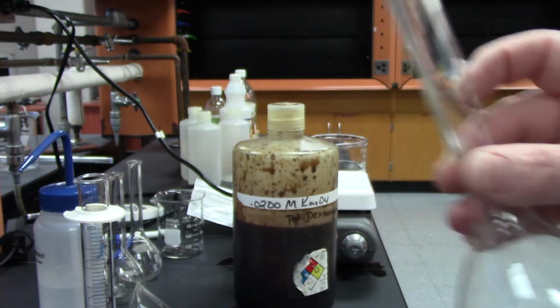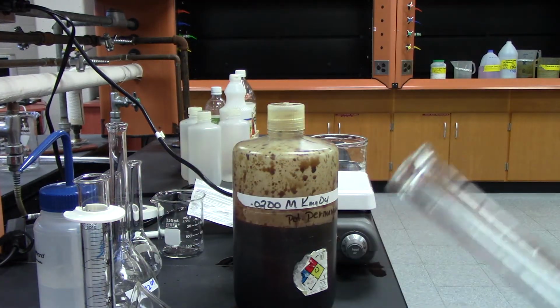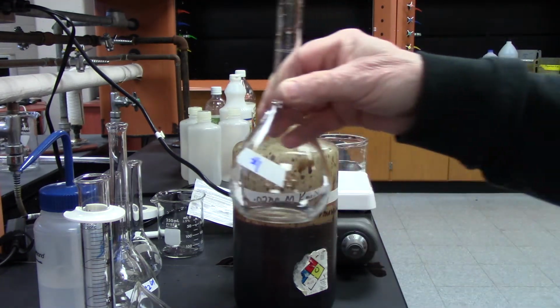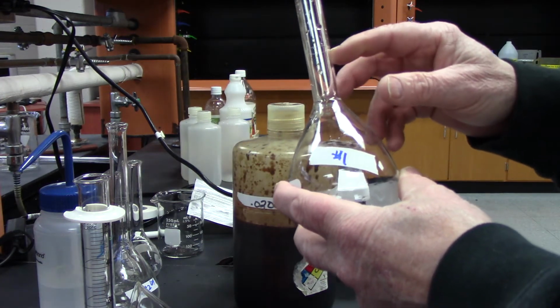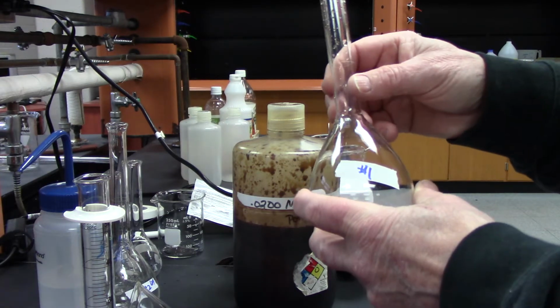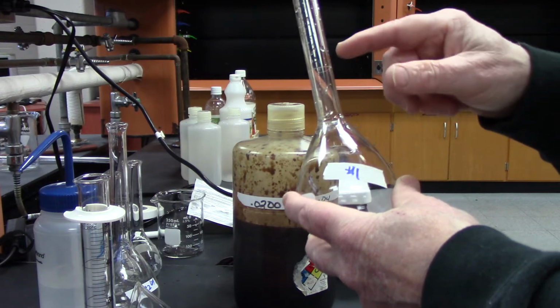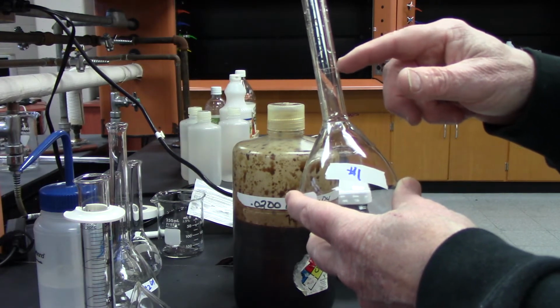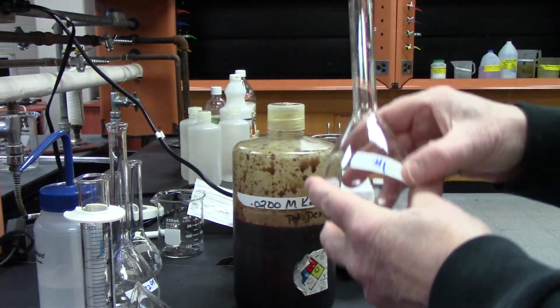Okay, and that's because when they made these, they don't just make them through automation. They make the teardrop part all the same, but they have to make sure they have a device that makes sure that line is exactly where it is. So each volumetric flask will have their line in a different spot. And so when we fill this, this will have the volume of the solution. The meniscus will be on the bottom of that line.